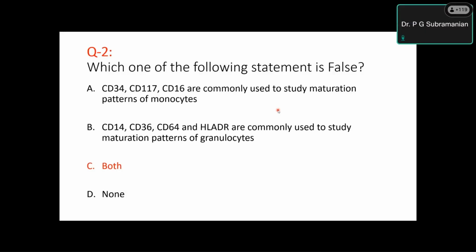I'm guessing that the person who asked the question wanted to know about what we are saying regarding classical, intermediate and non-classical monocytes. Much of what we are showing is already published by other groups, and there is a lot of intergroup agreement on this. So that is one way of cross-validation. As such, we have not done detailed sorting and analysis to show this ourselves, but other groups have done that and showed that these patterns are related.